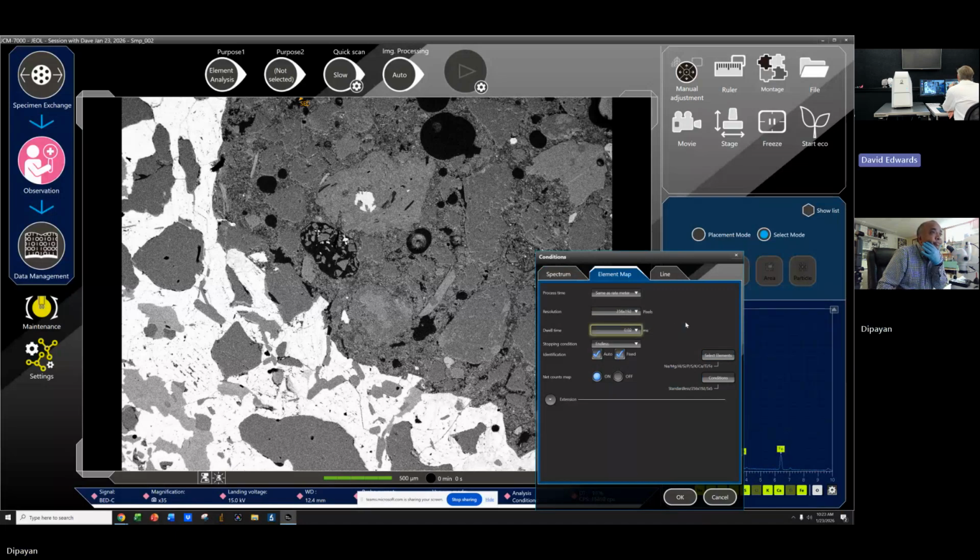Okay. That's 50,000 pixels, which is 50,000 individual spectra being stored, and it's about 11 or 12 megabytes. If you go to the next one, the 512, it's 50 megabytes. So if I can stay there and get a decent map, that's fine. Let's stay there. And then stopping condition, I keep endless because I decide when to come and stop it. Then extension as well. Oh, extension, and probe tracking, and I usually use 30 seconds.